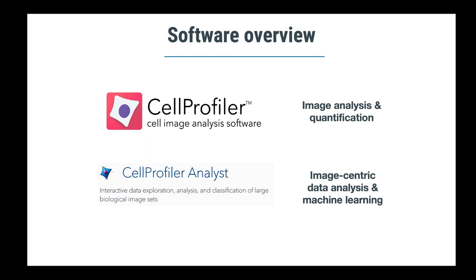If you want to learn more about CellProfiler-Analyst, you can check out the previous stream that we did 2 weeks ago, where I give a basic overview as to how that software works. So why is it important to create a tool like CellProfiler-Analyst, and what value does it add to you doing your science?